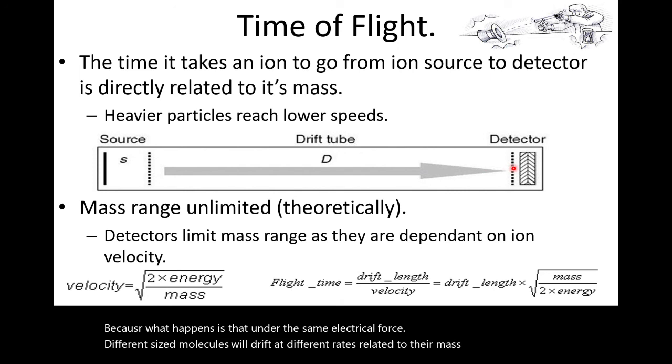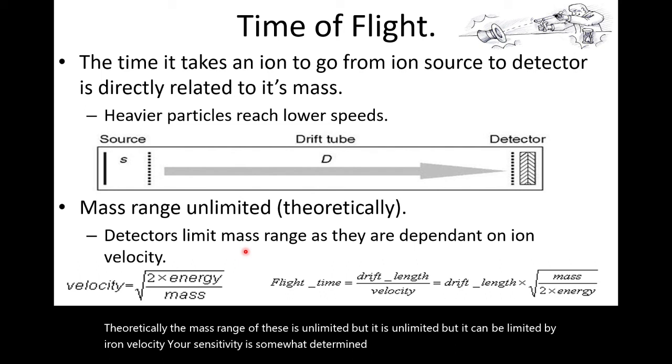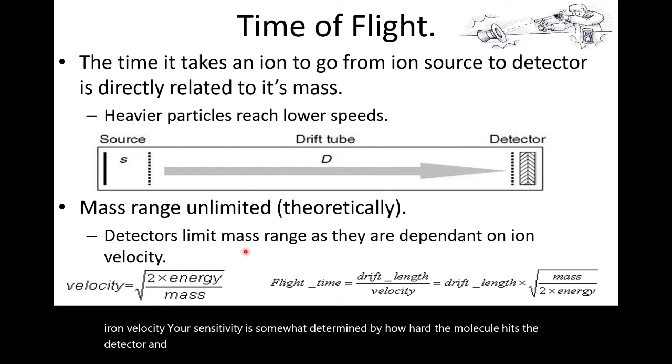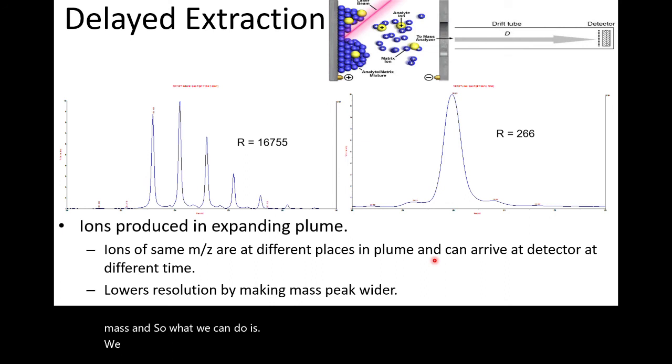Theoretically, the mass range of these is unlimited, but it can be limited by ion velocity. Your sensitivity is somewhat determined by how hard the molecule hits the detector. Larger molecules have lower velocity, so they don't tend to hit the detector as hard. The flight time can be calculated by this equation, and you can use that to calculate the mass. So we can use this to measure the mass of our molecules.